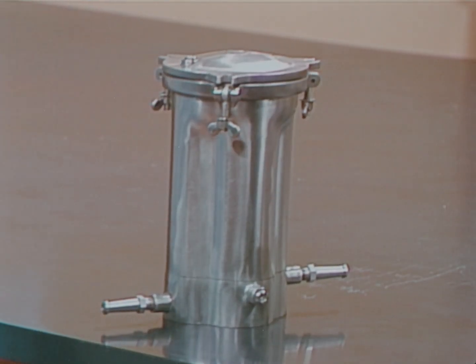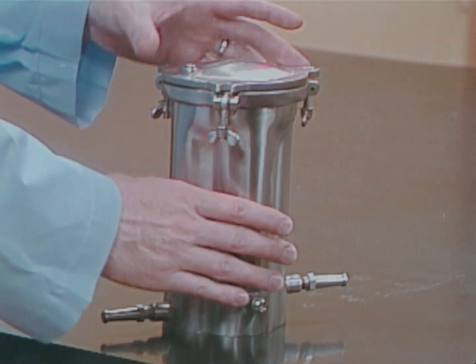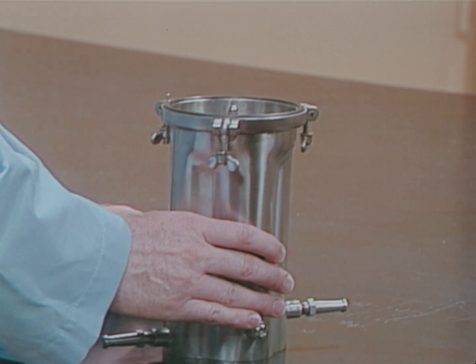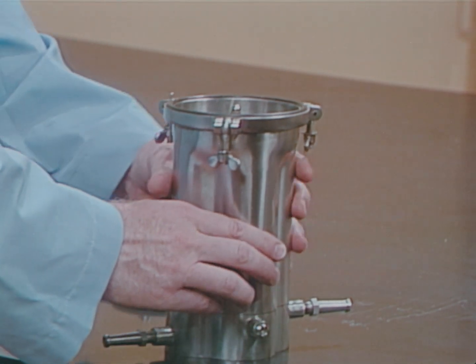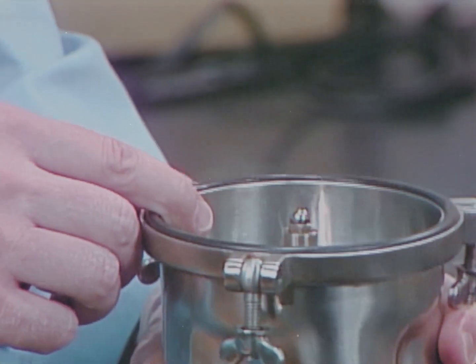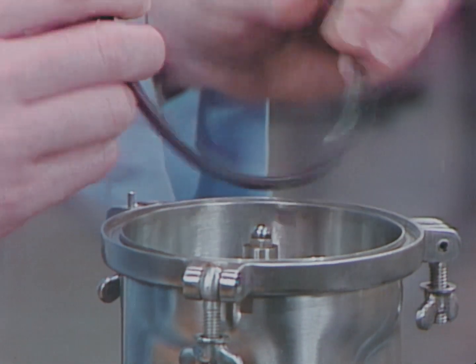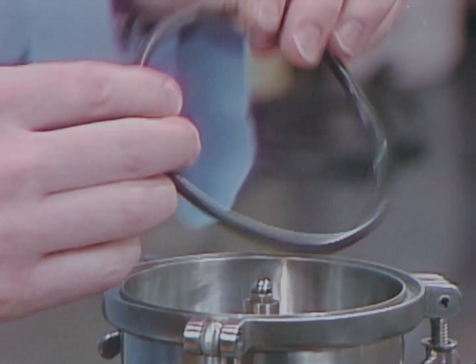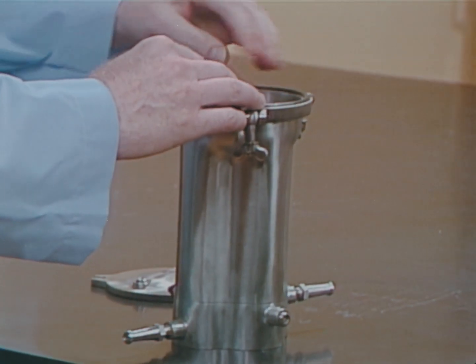A properly functioning aerosol-free blender gives excellent protection from infectious aerosols. But bearings in the cutting blade shaft should be regularly inspected and replaced when worn. Always inspect the O-ring seal or rubber gasket. A damaged gasket permits aerosols to be released.